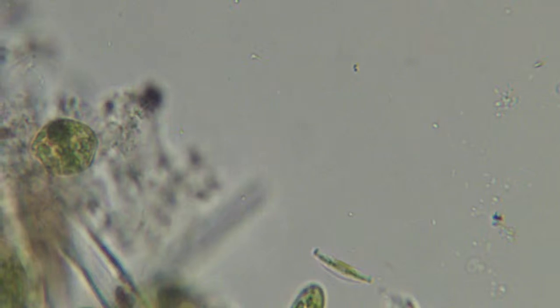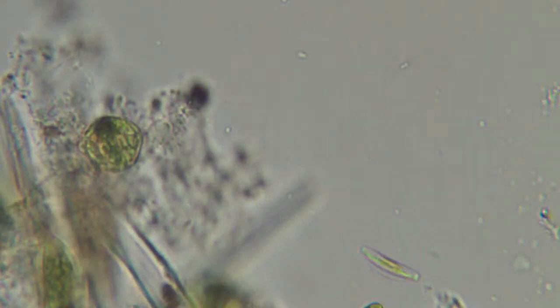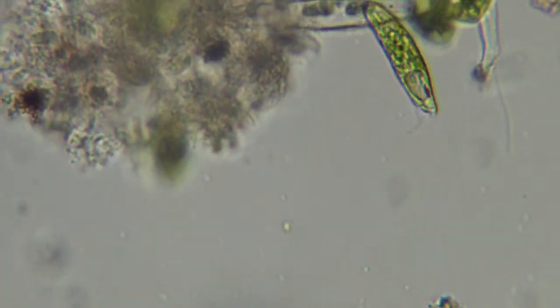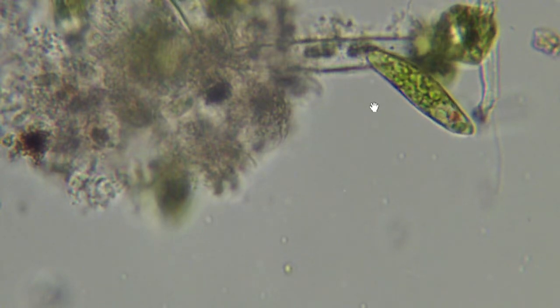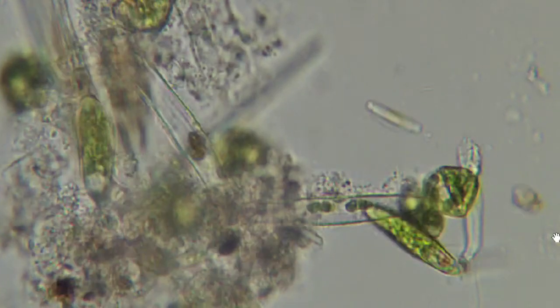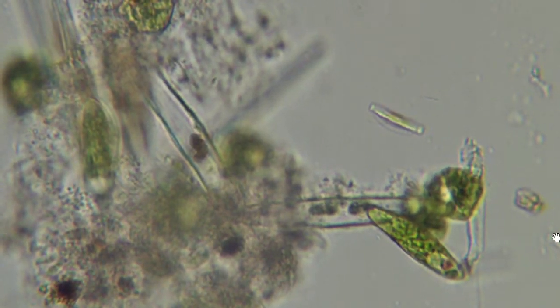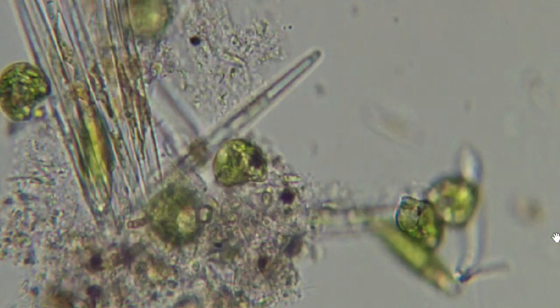What else we got here? All right, I think I'll end on this shot. It's a nice little composite of Euglena, diatoms, some debris, some dead diatoms. Zoom out here just a tad so it looks a little bit better. So, some diatom shells there, Euglena, live diatoms. These guys are still moving a bit in here.